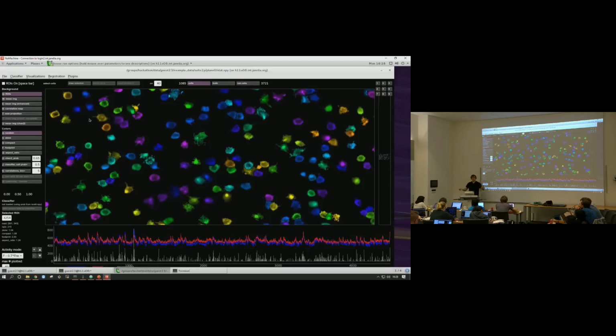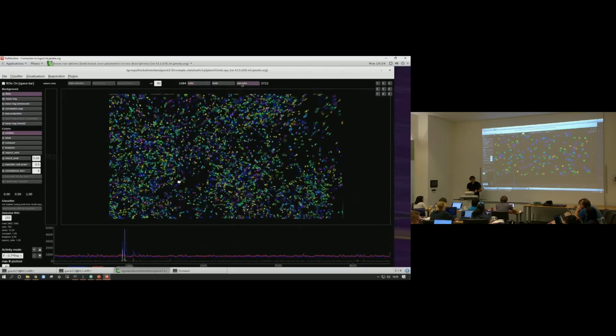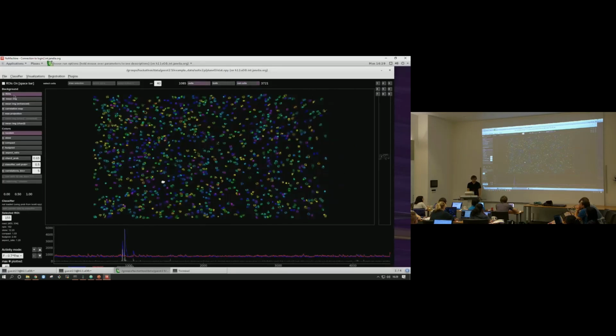The other one is the probability given by the classifier. And every single time you press your right click, we're updating that file because it's a very small file. So we just update it instantly. So you never have to actually save the manual curation that you did. It's already automatically saved.